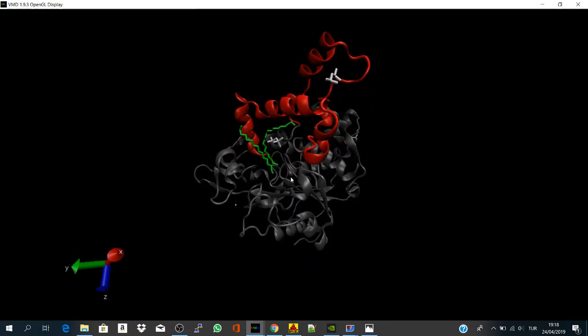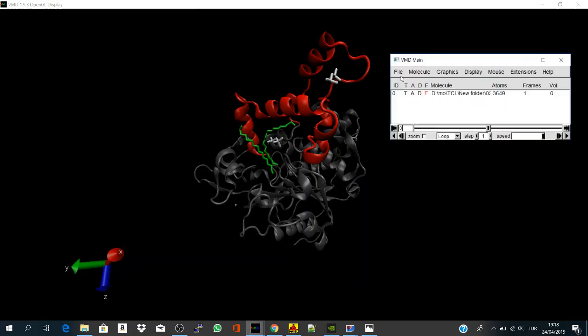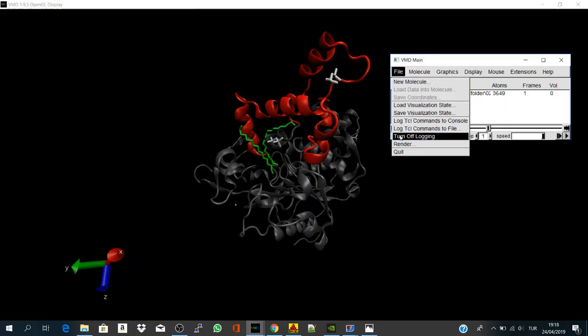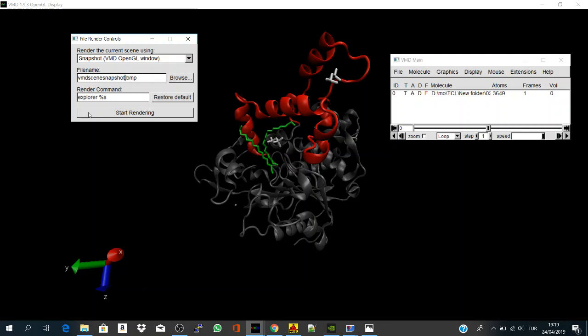Initially, the simplest way to get a figure from a representation is to go directly into VMD and file render, and here by default you will find the snapshot tool is working, which is taking only a snapshot of what you have here. And here you file name, you can say it snapshot, and you say start rendering.